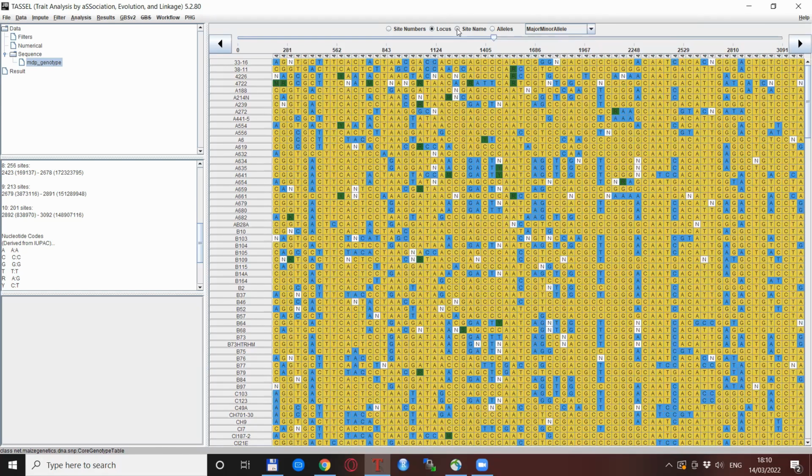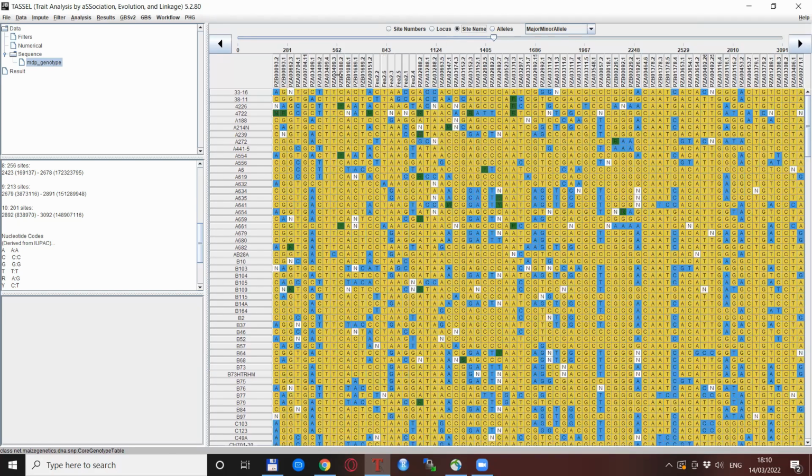The next one is the site name, which is the actual SNP name for that particular column. These are how the SNPs are called for this tutorial dataset, or sites anyway, because not necessarily all of them are SNPs, but in this channel we are dealing right now most of the time with SNPs, so we will concentrate on SNPs only. These are the actual site names, or the SNP names, that appear in the map file.